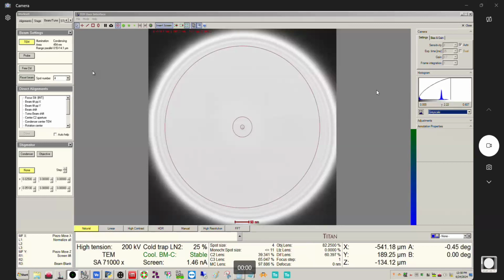I have heard this pronounced a couple of different ways. Sometimes I hear people call this the coma-free axis, like I'm in a coma in the hospital. I never understood that, because the idea is you're removing the tail from the comet. To me, it would make sense that you call it the comma-free axis, because you don't call it a comat, you call it a comet. But anyways, potato, potato. Anyways, we're going to talk about how to actually find the comma-free axis today.